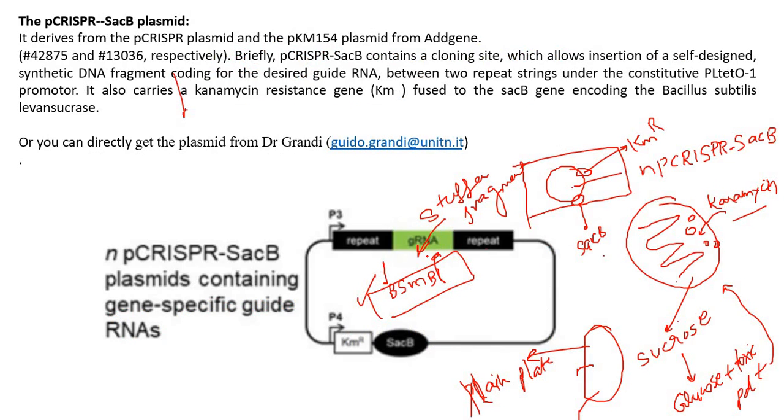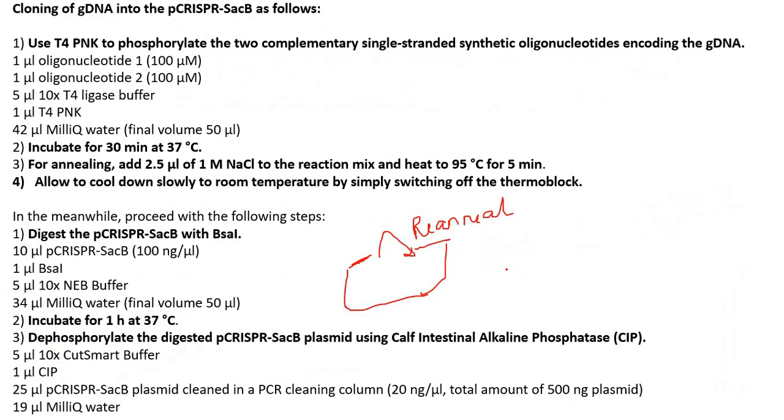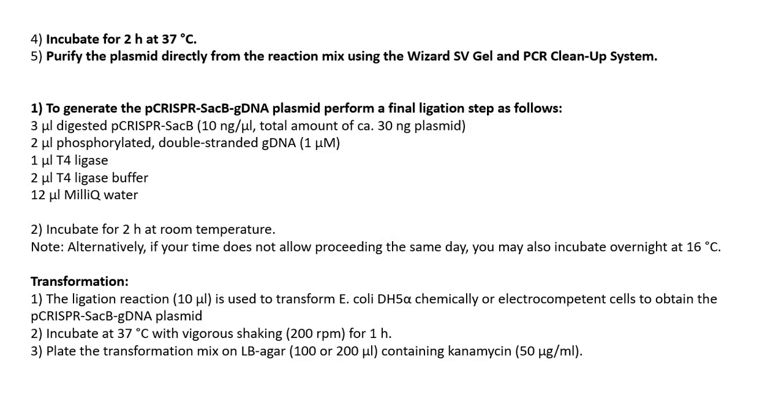This is a very common form of transformation. I have written the protocol, but you can just Google it and you will find the transformation protocol.